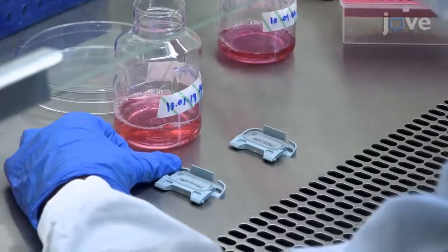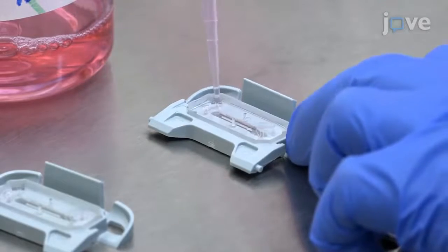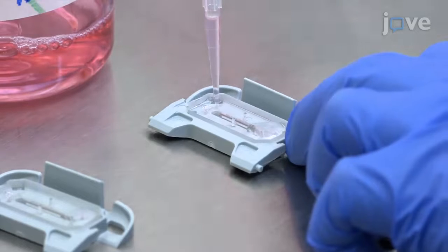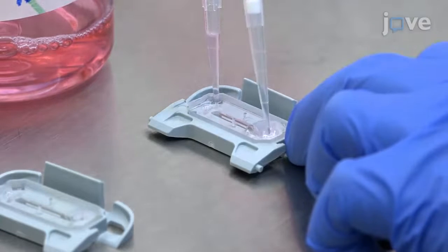Using a P200 pipette, gently wash both channels by adding 200 microliters of neural differentiation medium into the inlet and pulling the liquid from the outlet.